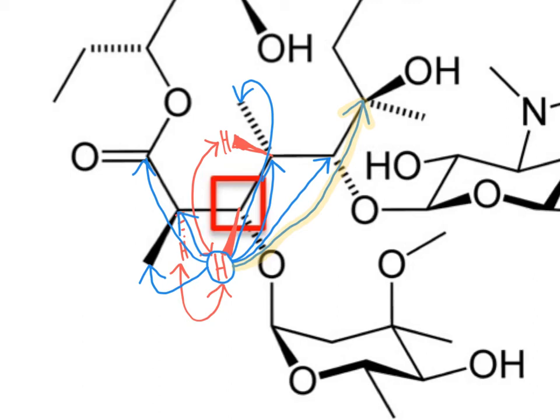And then coming in the other direction, coming this way, we would reach this oxygen atom here, so there won't be a 4-bond correlation there because there's no carbon to correlate to. And so the complete set of HMBC correlations I show here in blue, all spanning from that proton that's circled in red over to all of the carbon atoms that are 2 to 4 bonds away, and there are several there.